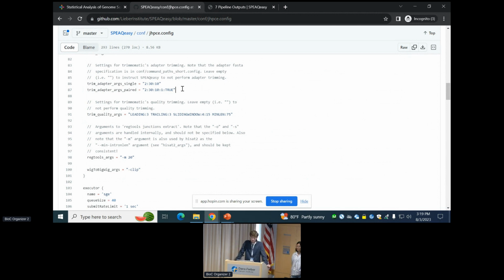Okay, it's just some of the defaults. If I'm only coming in with 100 base pair long reads, a minimum of 75 seems pretty long. If it ends up smaller than 75 after trimming, you're getting rid of it, which seems a little extreme if I'm only coming in with 100 base pair reads. But if I'm coming in with 2 by 150 reads, then 75 seems a little bit more reasonable. Yeah, if I remember correctly, we did develop it with the 2 by 150 idea in mind. Well, it gets back to wanting to make something easy for people to use by picking values for all of these things, and for the most part you're coming in with human data like this and it'll all work fine.